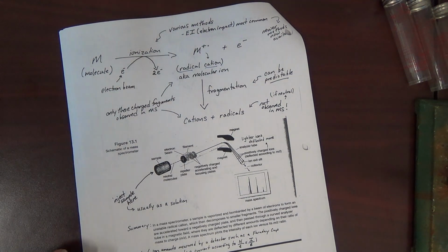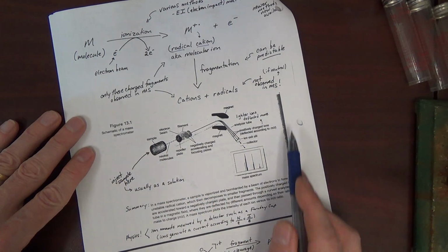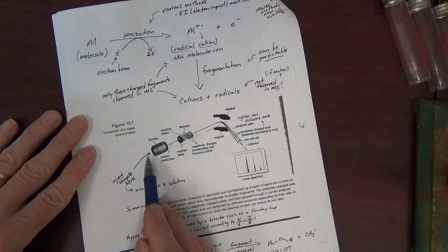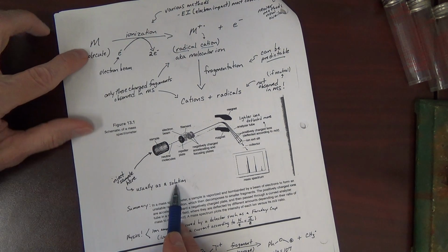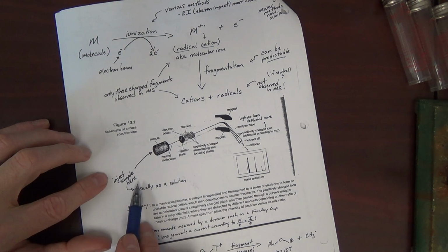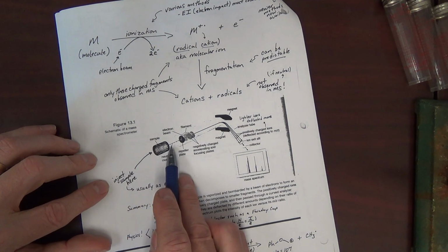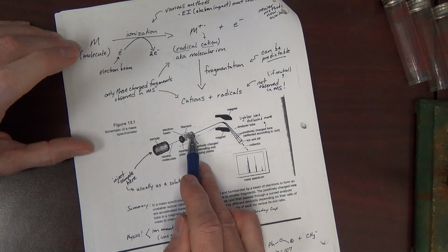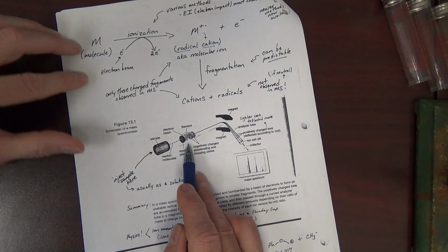Okay, let's look underneath the hood of the instrument. All this is in a box. If you look at an instrument, you will see just sort of a port where you inject your sample. We typically inject a solution, so your molecule is dissolved in some type of solvent. And we use a syringe. We inject into the sample port. The sample goes into basically the ionization chamber, where it encounters the electron beam, and ionization takes place.